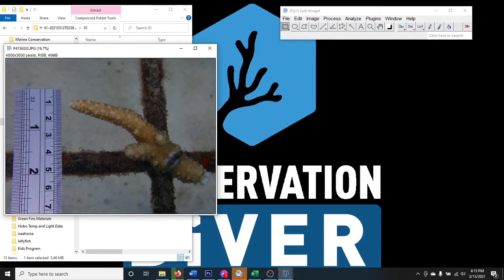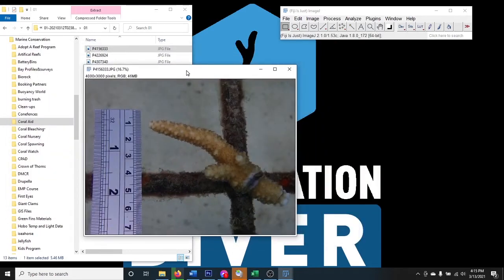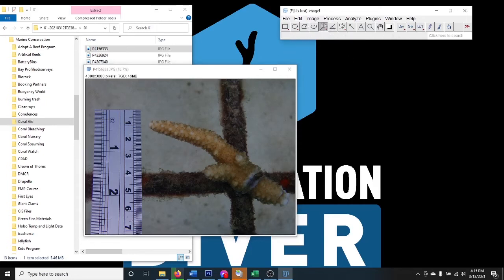The first step before we measure this coral is to set the scale for the photograph so we know the dimensions. We're going to utilize the ruler in the image to set the number of pixels per centimeter. I like to find a straight line, so grab the straight line tool and start at zero on the ruler.